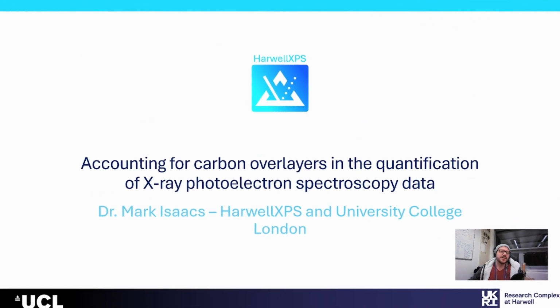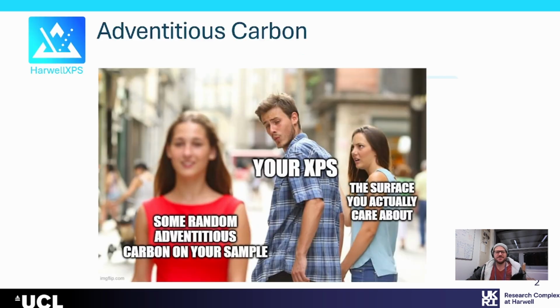Hello everyone. Today we are looking at the quantification of XPS data and how we take into account that thing that everyone knows is all over any surface you might want to put into an XPS: carbon overlayers. Okay, we have to acknowledge the universal truth of XPS analysis.